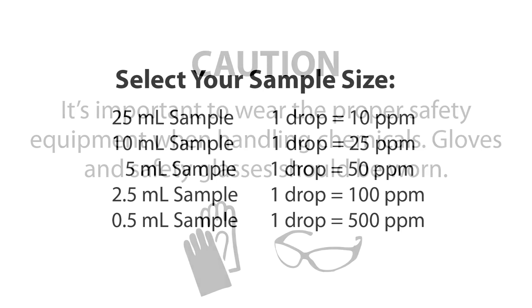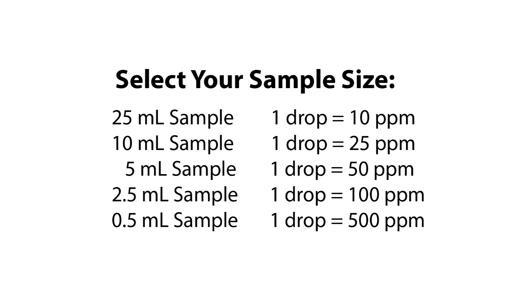The first step according to the Endpoint ID procedure is to select the appropriate sample size. You want to select a sample size that matches the equivalency you would like to use. In this example, we are going to use a 25 ml sample. Therefore, our equivalency is 1 drop equals 10 parts per million as Chloride.